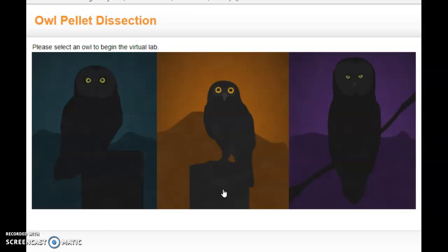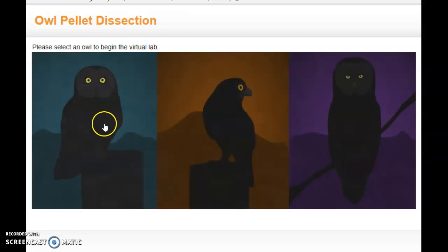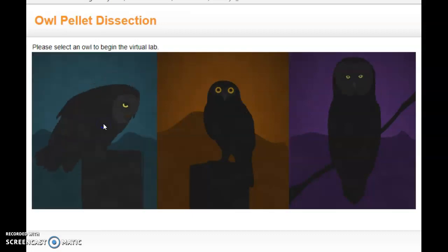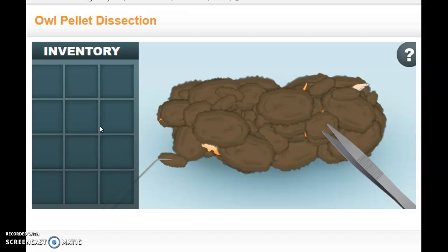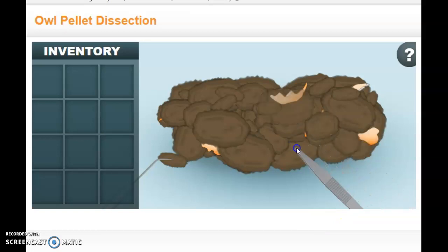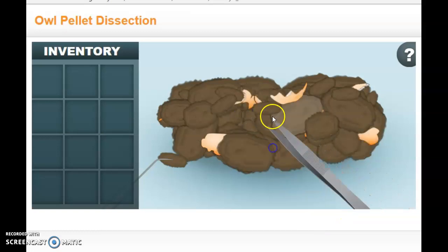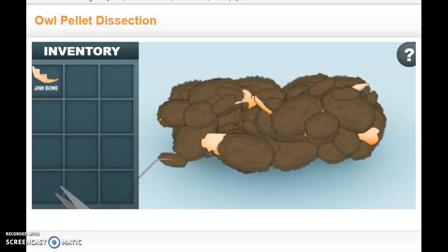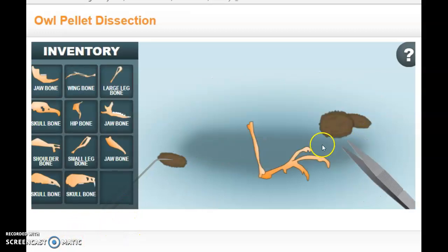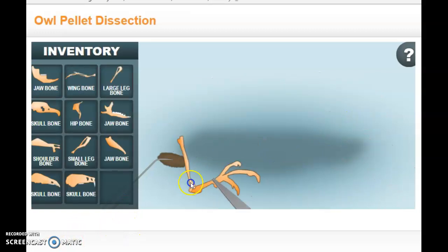The owl throws it up every night. I'm going to pick an owl — this one right here — and he's going to throw up his owl pellet. What you're going to do is pick apart this owl pellet using the tweezers, then take the bones and put them in your inventory. I've cleared away all the fur and put all of the bones into the inventory.